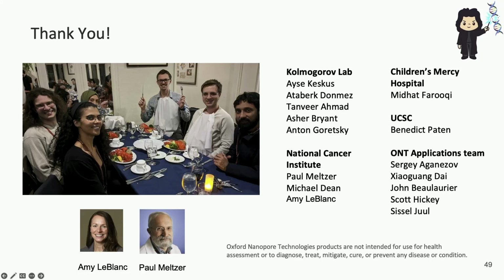Hi, thank you. It's Mike Demur, very interesting. The question is regarding actual tumor samples. You need frozen tissue, not paraffin, because of the template, but what about tumor purity? You do microdissection, and what kind of tumor purity do you need for your sequencing?